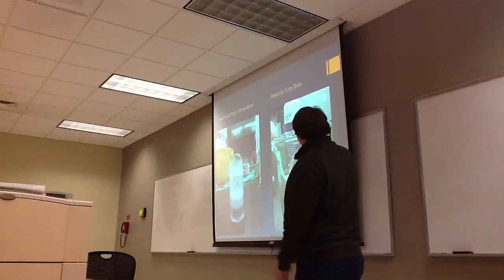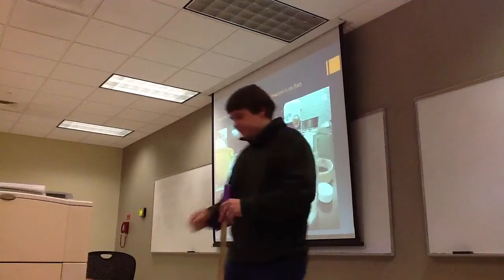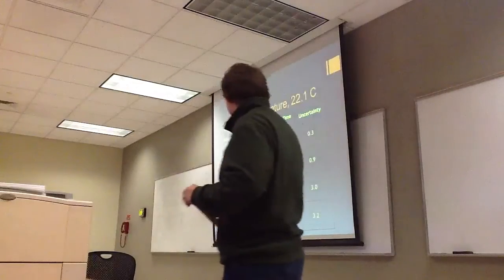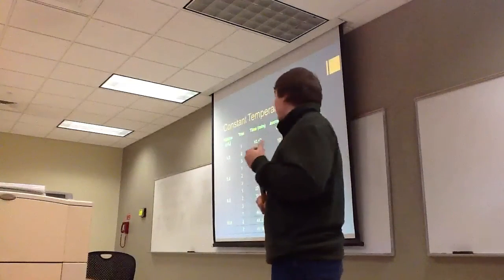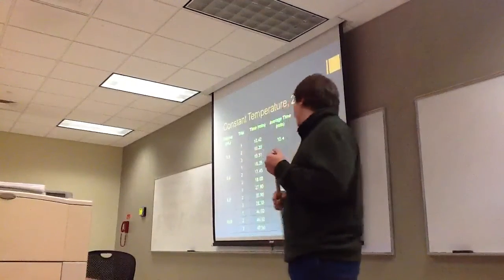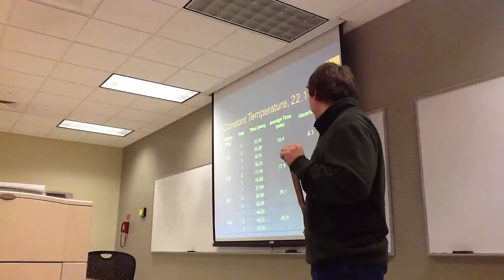This is the example of cold temperature that we did, and it's just an ice bath. Here's some of the data that we took for constant temperature of 22.1 degrees Celsius. We did it at various volumes to try to see the average time of reaction, how long it would take.